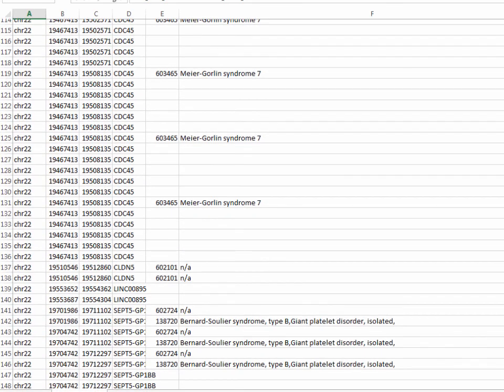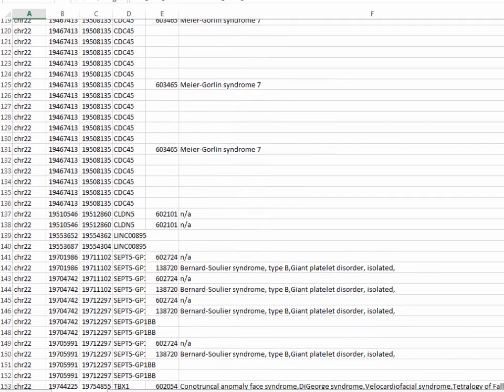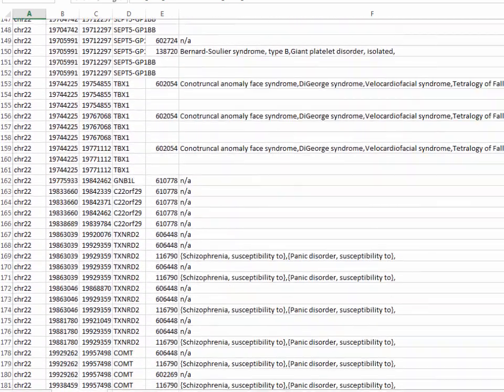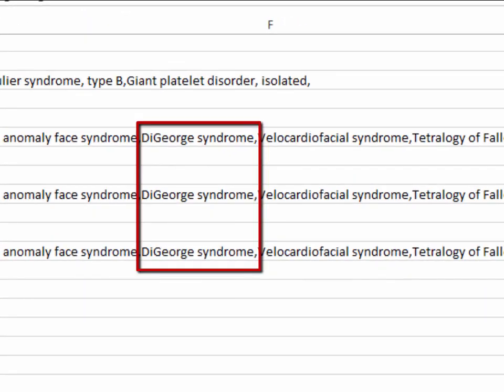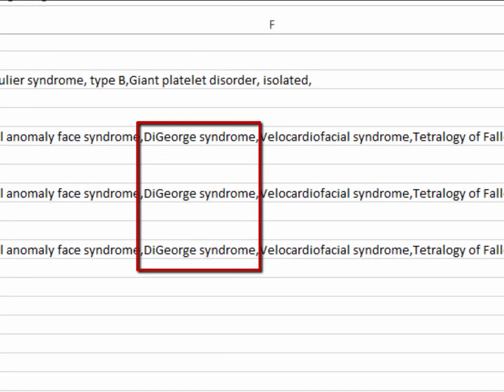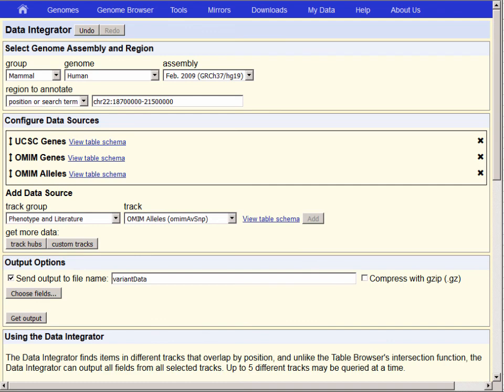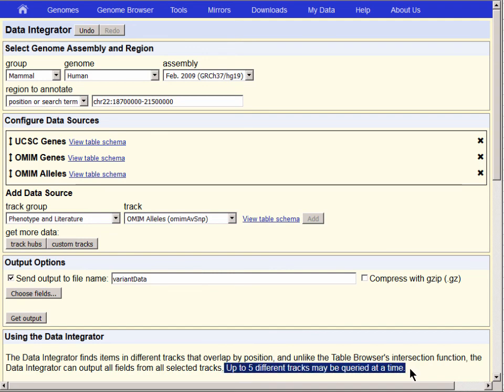That concludes our demonstration of how to export data using the Data Integrator. This tool can be used for integrating data from any one of the data tables in the Genome database. It's possible to add data from up to five different primary tables in the browser, plus, as we have already demonstrated, many of the secondary tables as well.